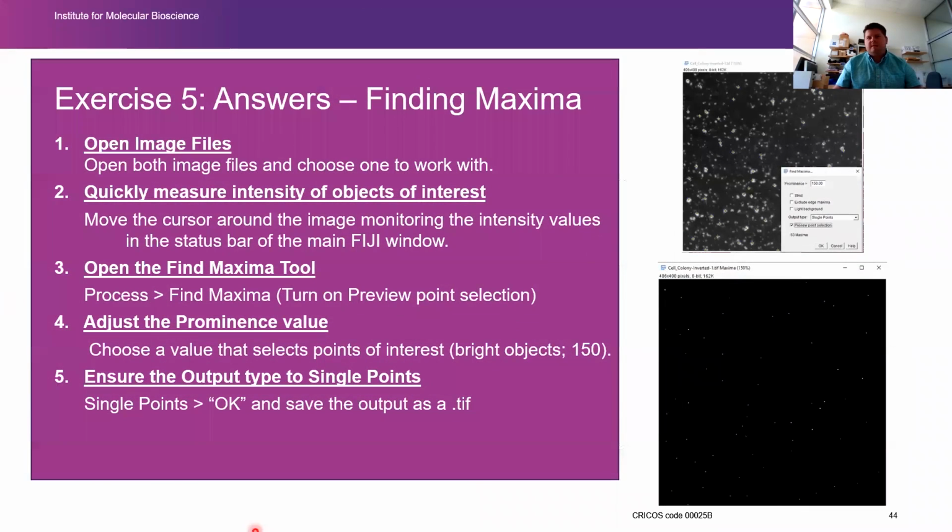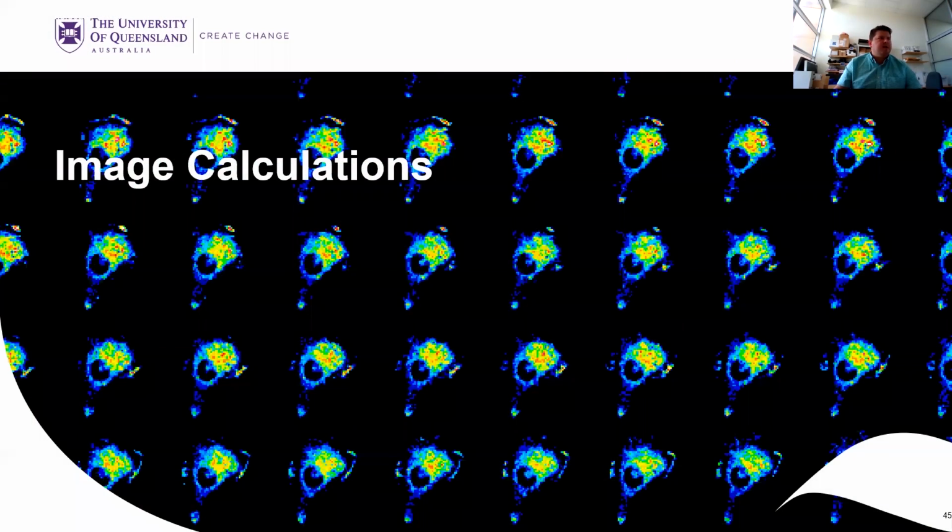Again, answer slide in the PowerPoint or the PDF that's up there on the cloud, where you can go through and see what it's doing and the steps to do that. Okay, so I had the question before about the image, when you do that subtraction down from 255 to 1, and this is the step in which we'll go through and show where that can be useful.